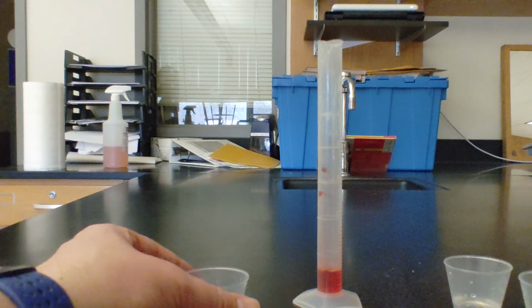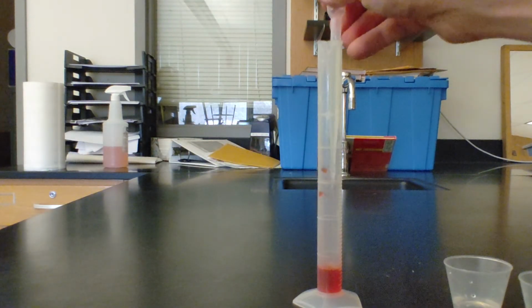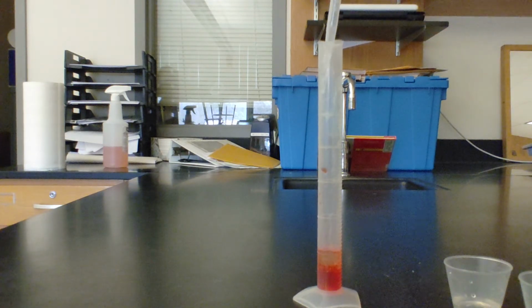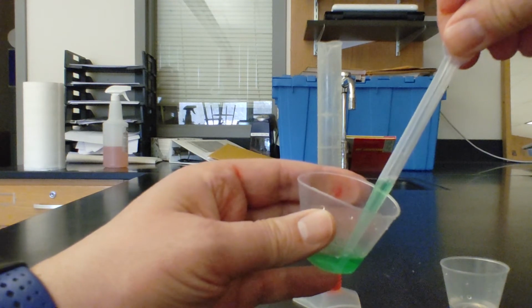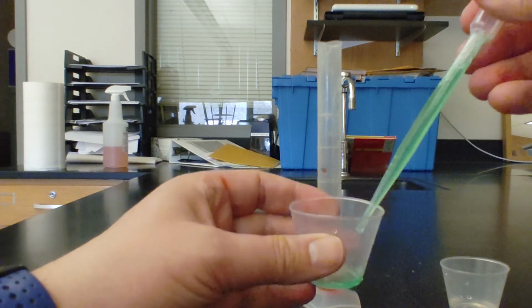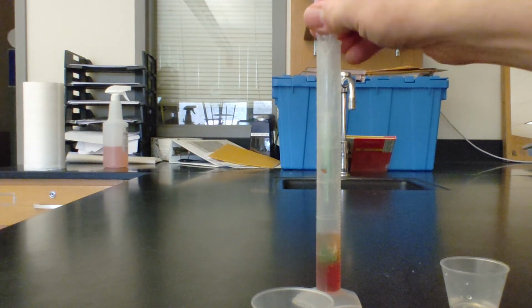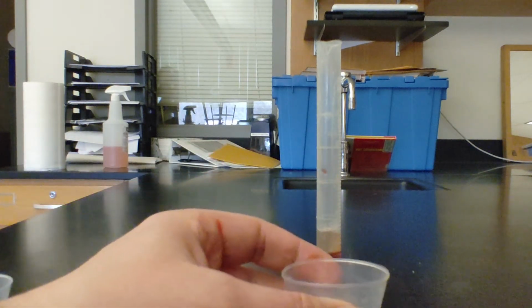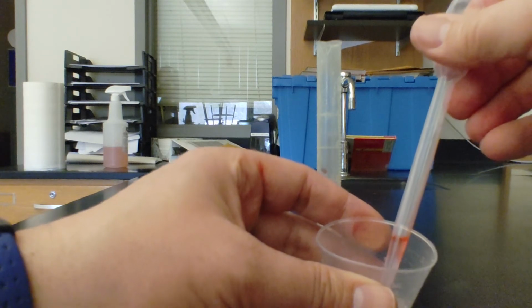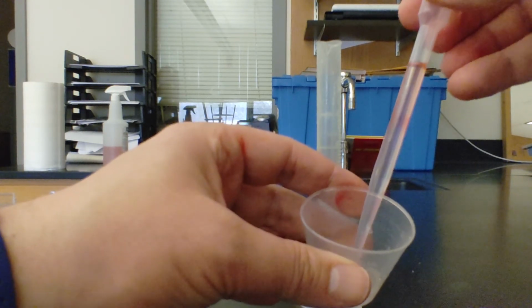And then I'm going to take the vegetable oil. And now I'm going to take the dish soap. And finally, I will take the glycerin.